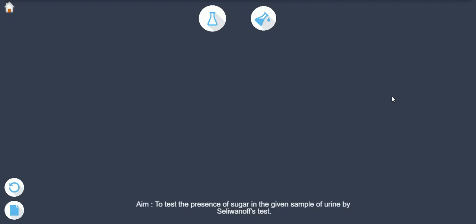Aim: To test the presence of sugar in the given sample of urine by Seliwanoff's test.